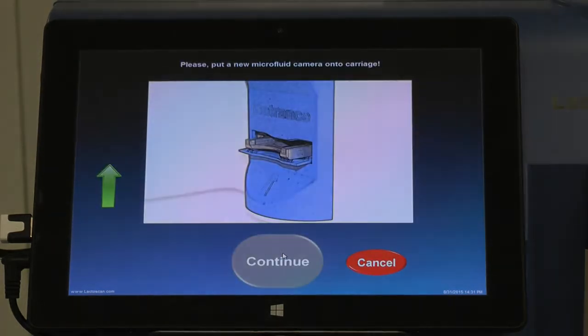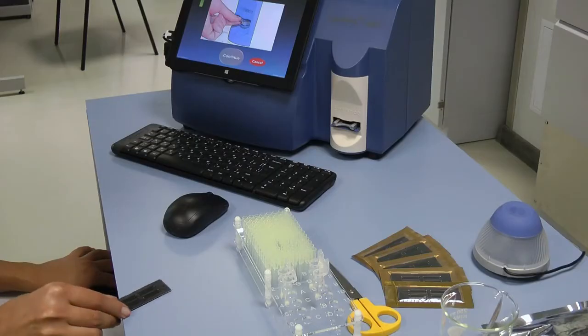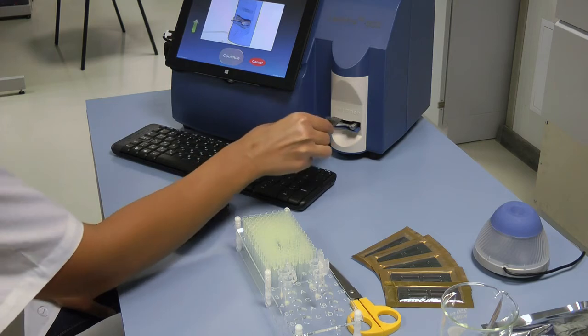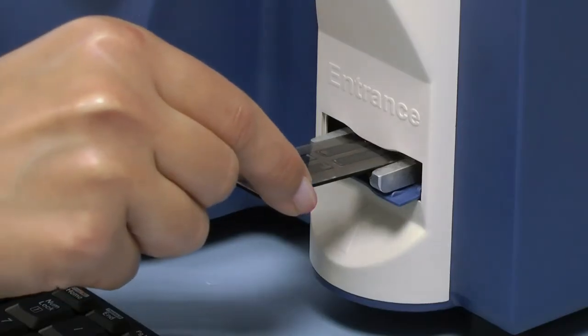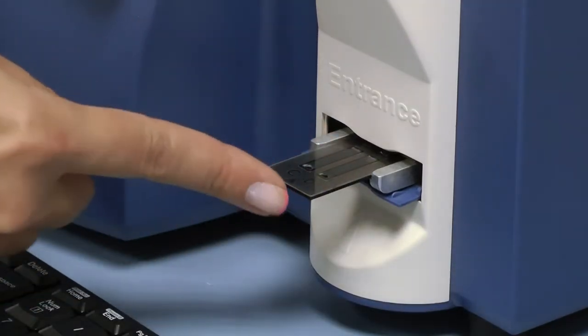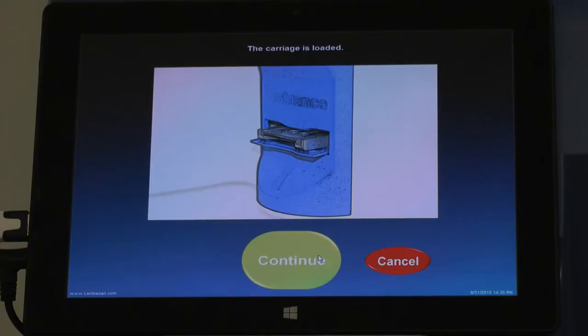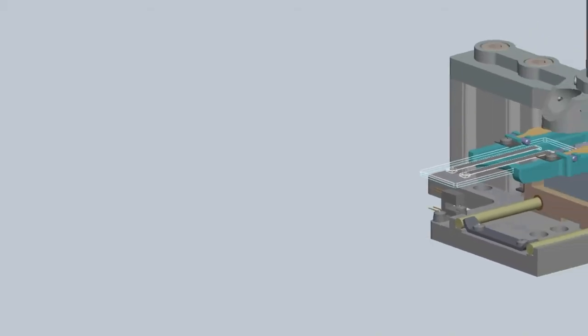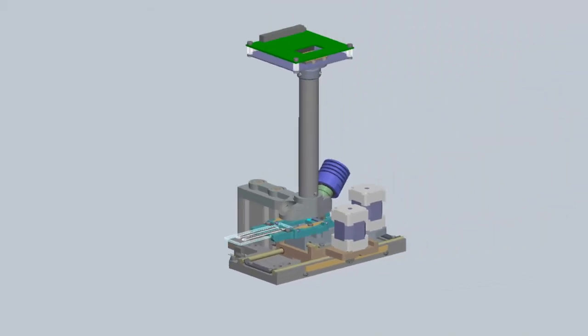On the screen, a message will be displayed showing that the carriage for placing the LactoChip comes out of the door. Place the LactoChip into the carriage and press Continue. The device is now making the analysis of the samples.